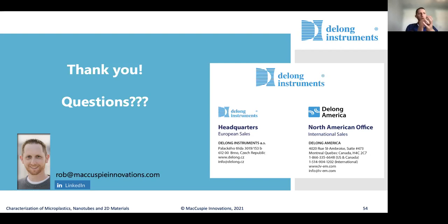There's also the Nanotechnology Characterization Laboratory, which is part of the National Cancer Institute, NIST and the FDA. They have made an assay cascade protocol series, and they have some protocols there for deposition of nanomaterials onto TEM grids for sample preps. That's also a great resource if you're looking for more information.